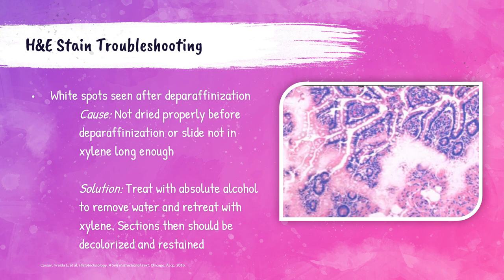Many errors can happen with H&E stains. When white spots or incomplete staining are present in a section after deparaffinization, this is caused by the section not being dried properly prior to deparaffinization, or the slide not remaining in xylene long enough. Areas that still contain paraffin cannot be penetrated by the stain, resulting in white areas. To correct this, treat with absolute alcohol to remove water, then treat again with xylene to remove all paraffin, then decolorize and restain.